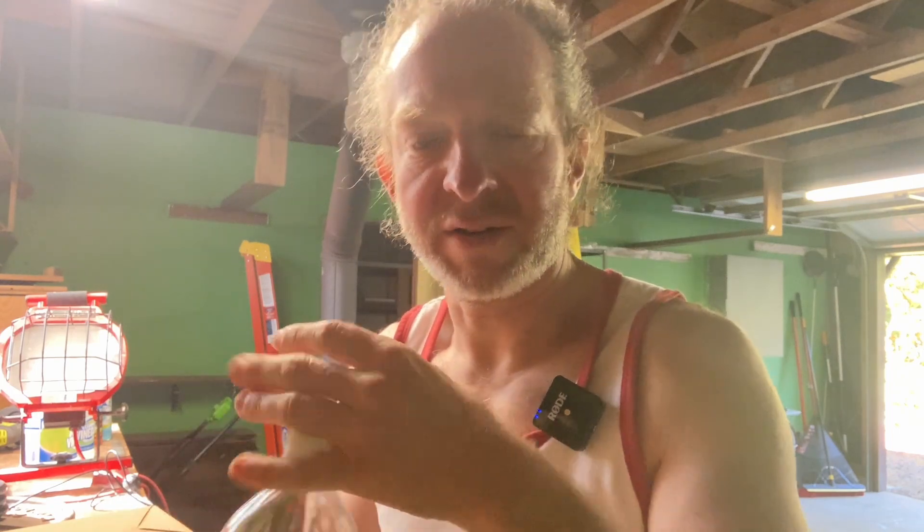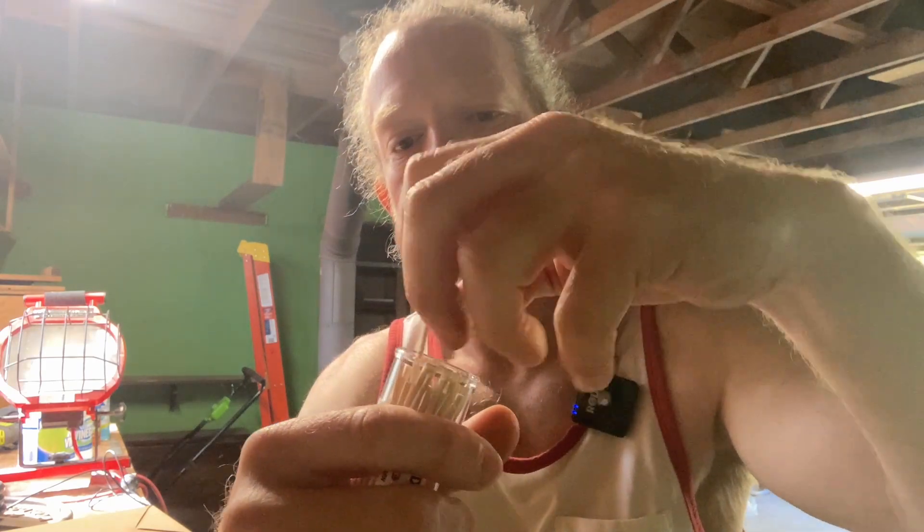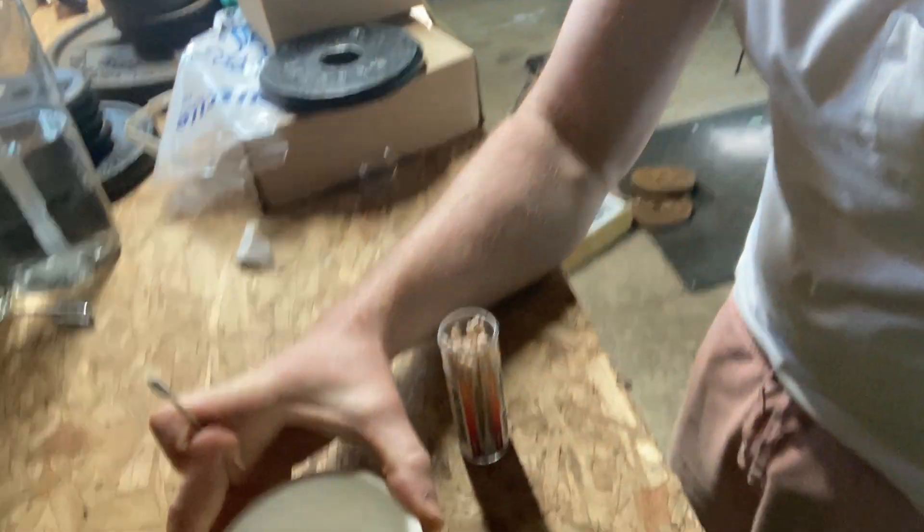I just got this stuff on Amazon. Step two says wet the swab with white vinegar. So let's take a swab out — okay, that's what it looks like. I'm gonna go ahead and pan the camera down so we can continue the process together.